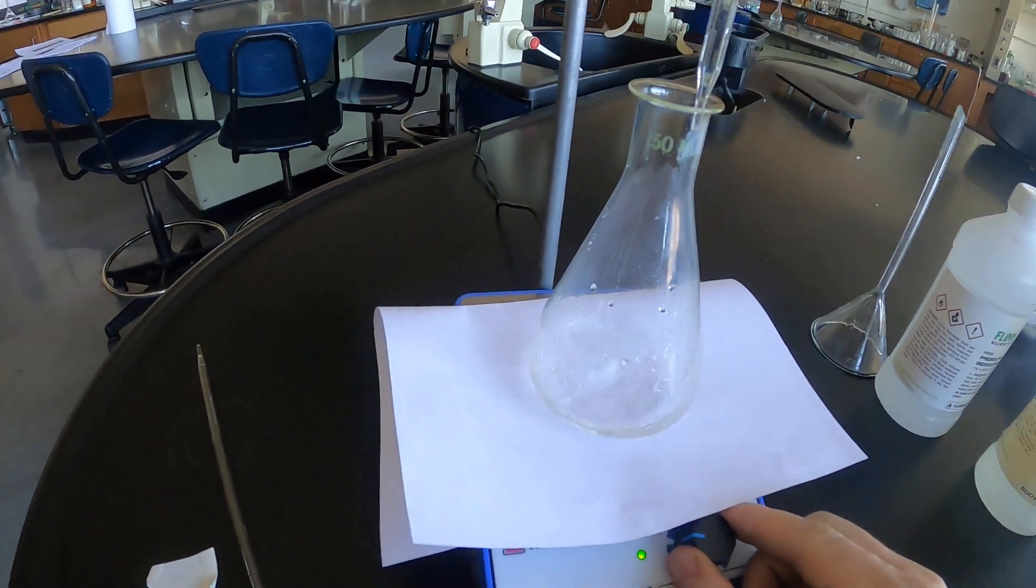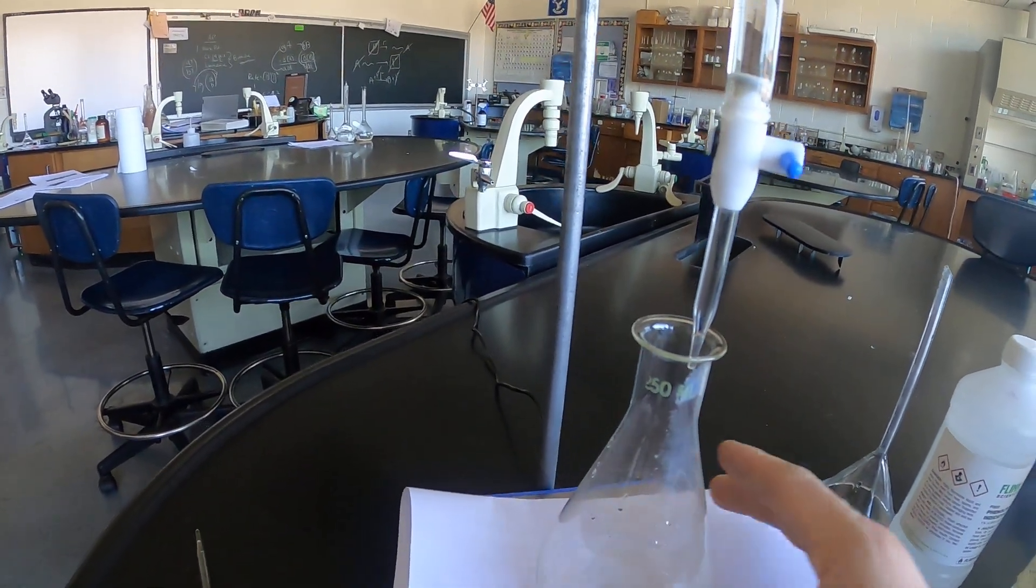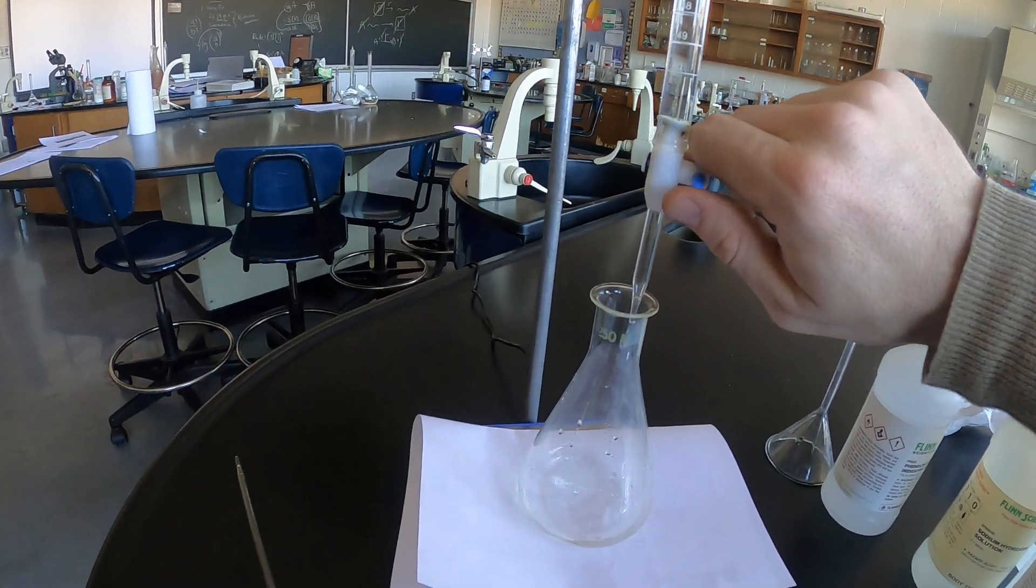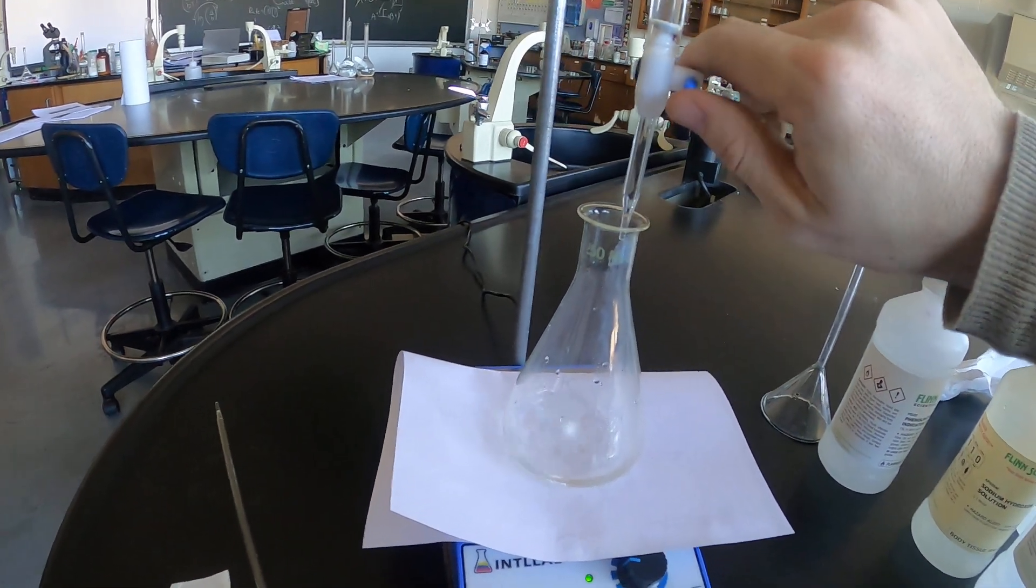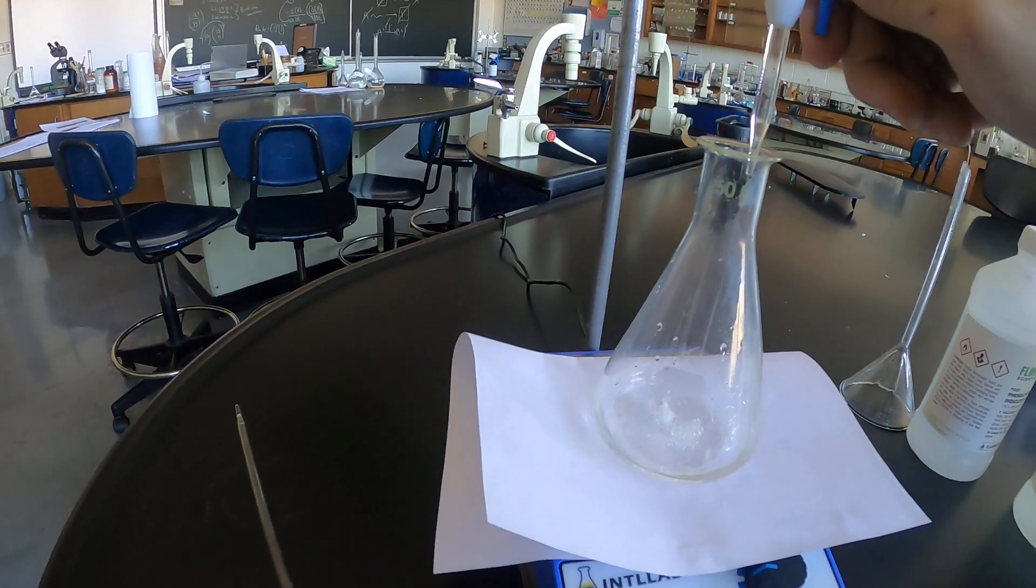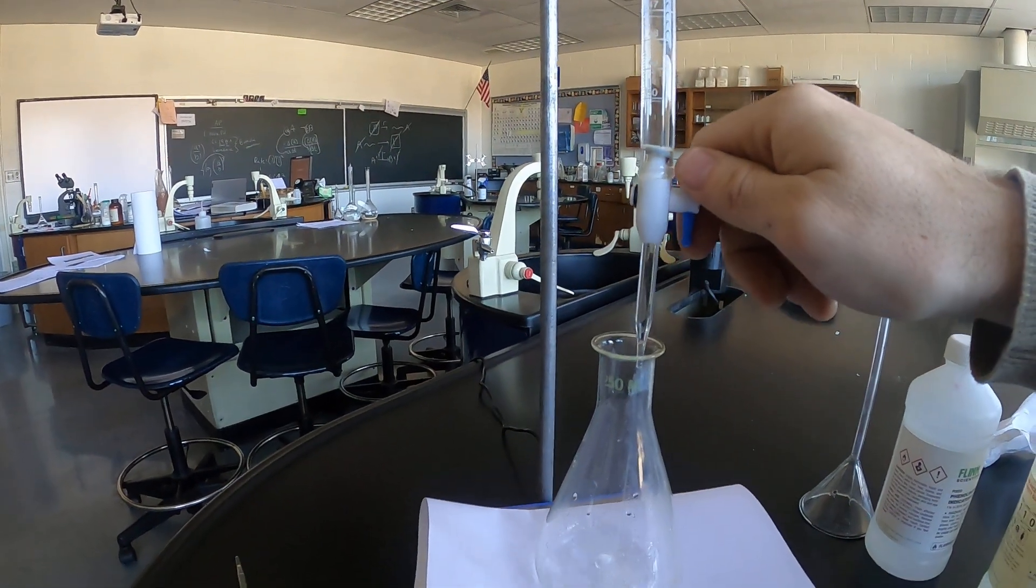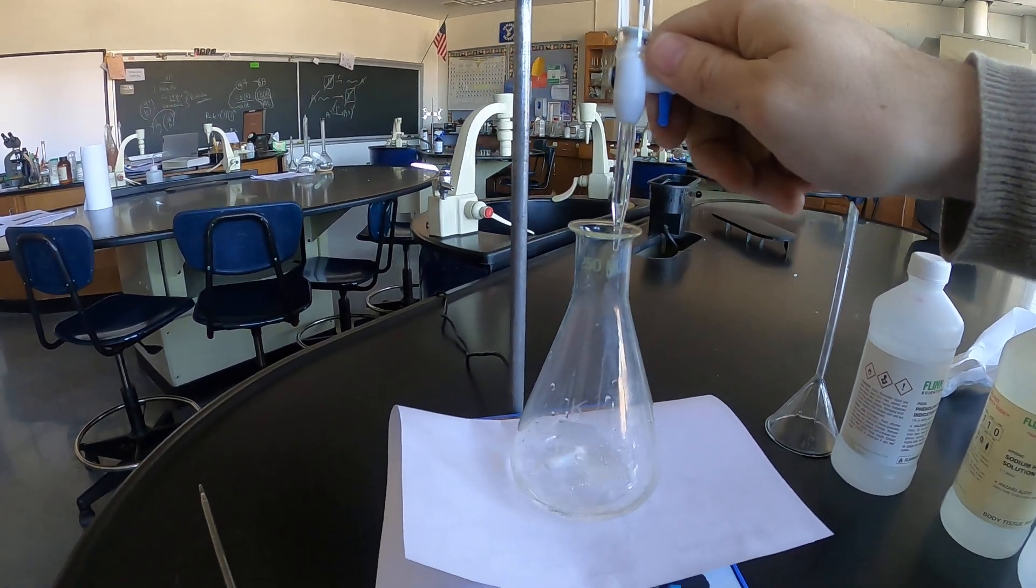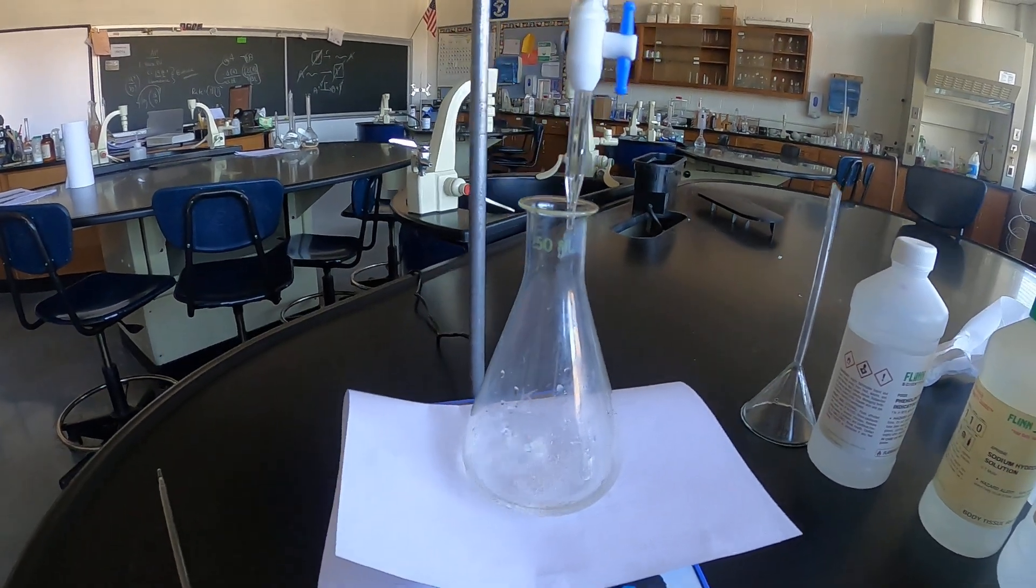So we got everything set up. 20 ml of analyte, burette's filled to zero, there are no air bubbles, I have added the indicator, we're essentially ready to titrate. So like I said I'm going to expect my endpoint to be somewhere around 20 ml but I'm going to titrate quickly at first, slow down at the end. So open my stopcock and letting quite a bit of titrant out.